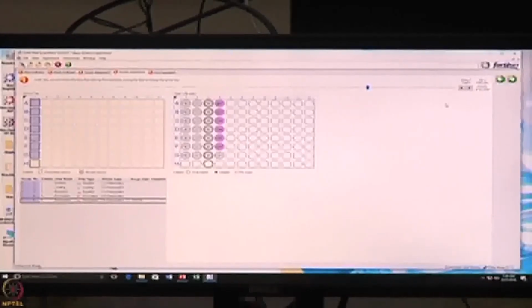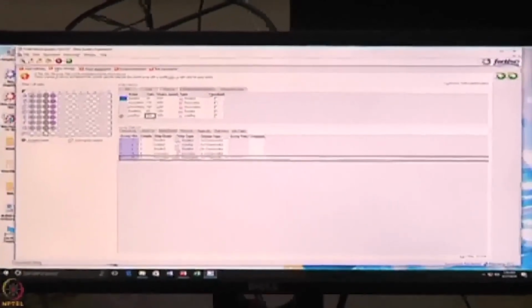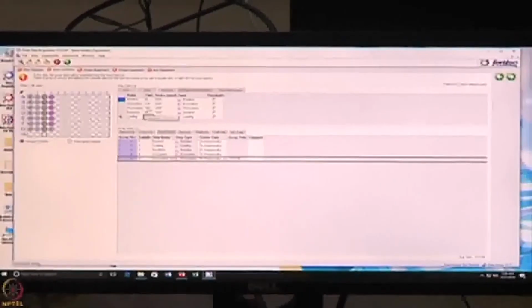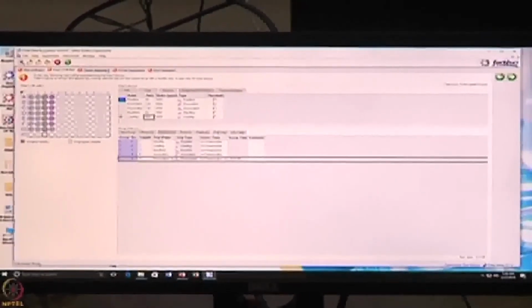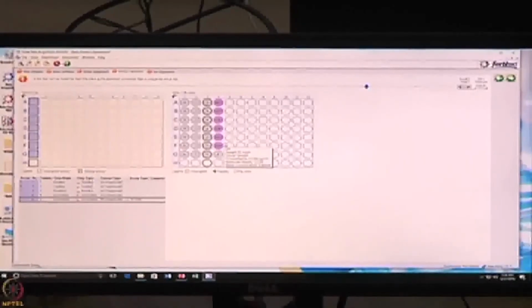So that's the actual real time that it's doing all those steps? Yes, yes. It seemed like it was going very fast. Yeah, it's a program, it just dips very quickly, that's all it needs to do. Based on the timing here, this is the review. Prior to the experiment, we are reviewing whether my experiment setup is fine or not. These are the timings I had provided here. Right, I see. So we review the experiment before starting the experiment.